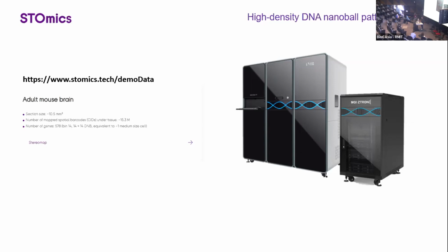Like the MGI machine, we have a very powerful sequencing machine and analysis server, which enables the sequencing and analysis of 50 human genomes within 1 day.